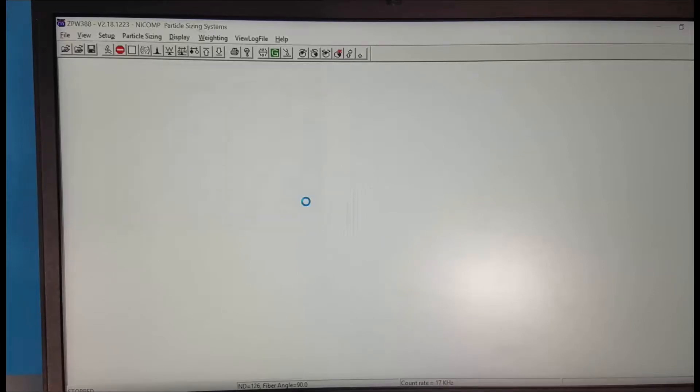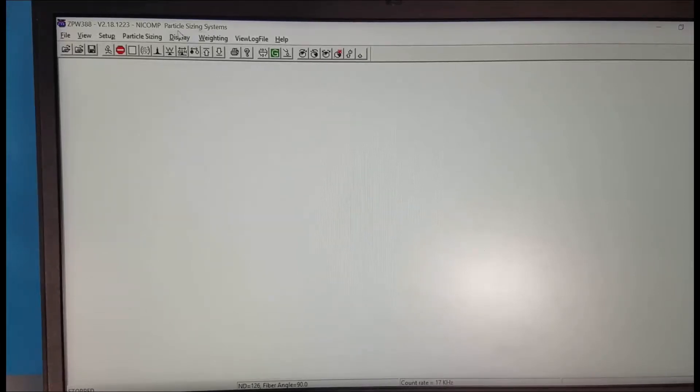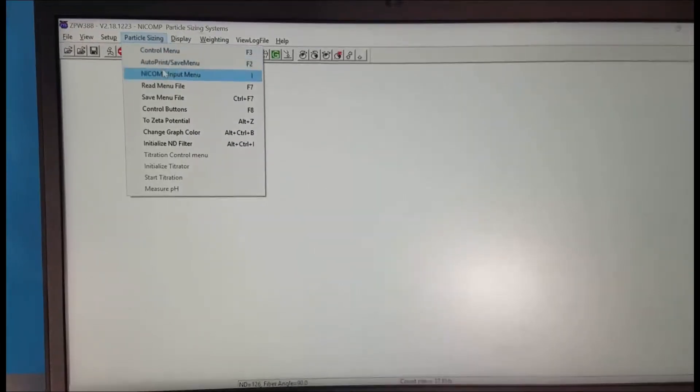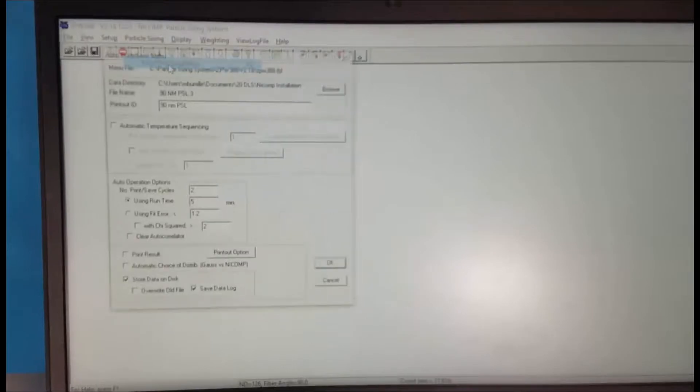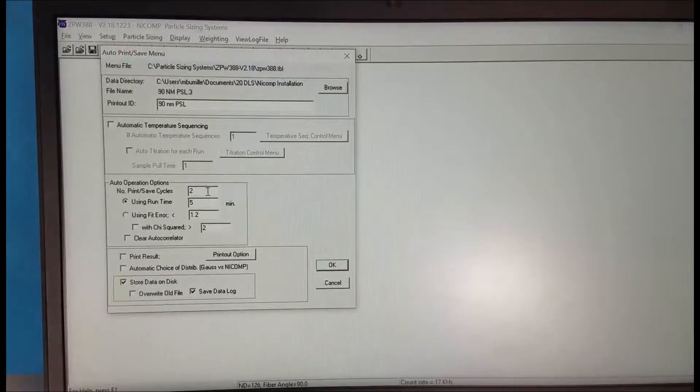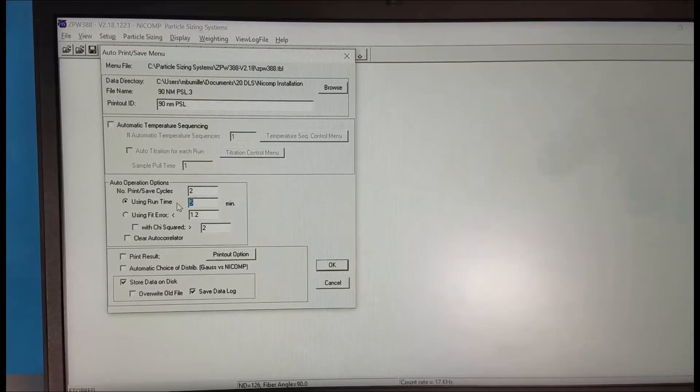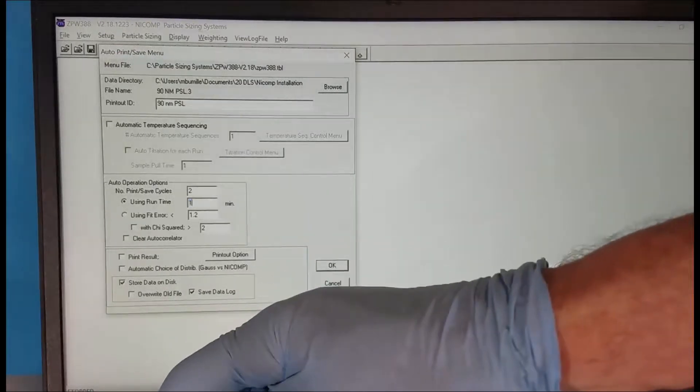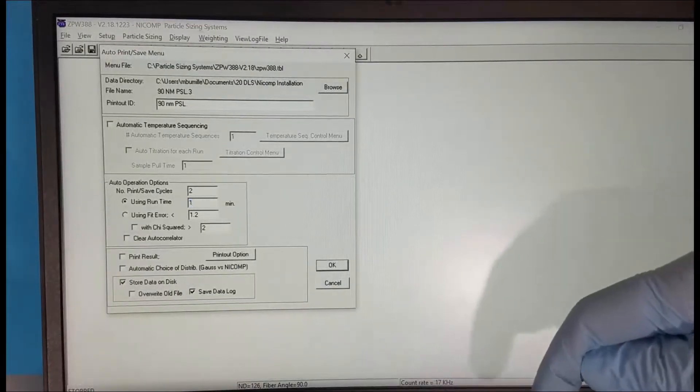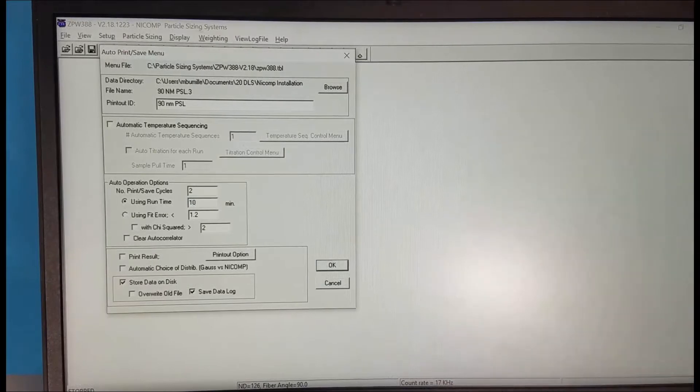We'll click OK and then under particle sizing the second menu down auto print save menu. This is where we enter the printout ID, how long we're going to take the measurement, how many measurements.